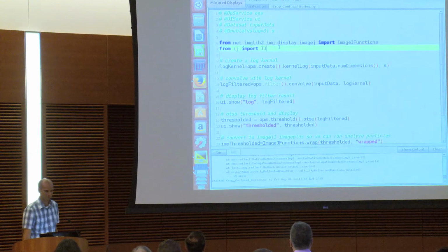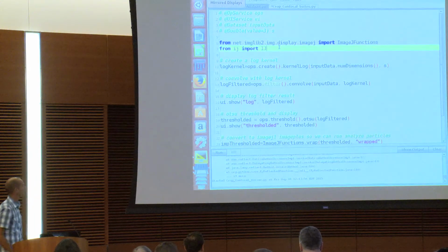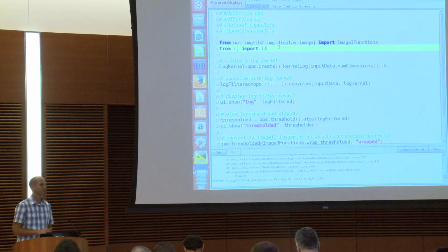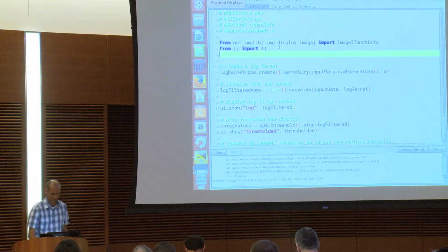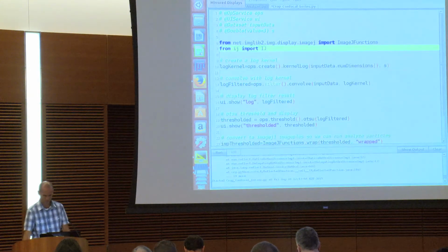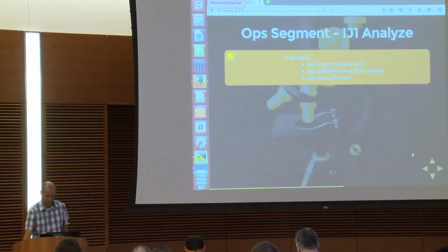Now I've almost got this, and now I'm going to do something a little bit nasty, because we found a glitch in this earlier. So I have to import. Actually, I'm going to do something a little mean, but not totally mean.